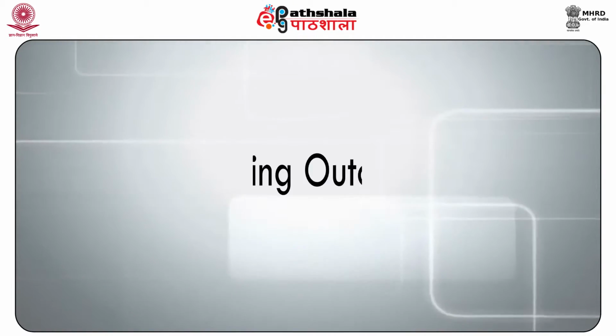Hence, it is difficult to maintain such a costly apparatus. It requires a lot of space and also huge maintenance cost. That is why it is not normally used by many laboratories in India. But this is one of the best methods if we can have the gold coating of the GSR particles.